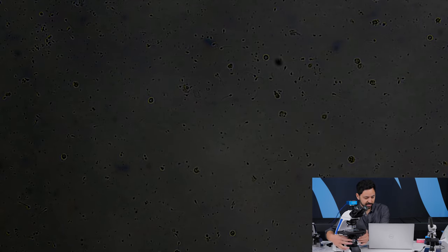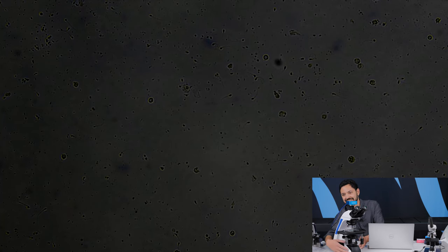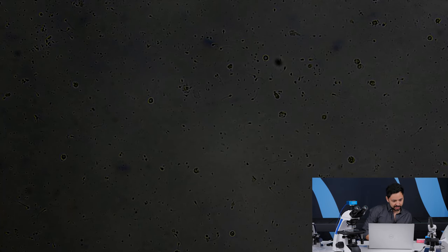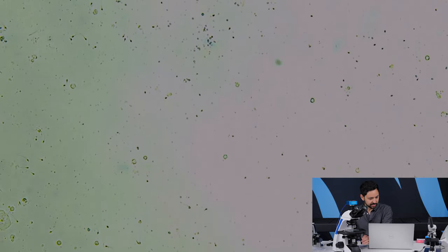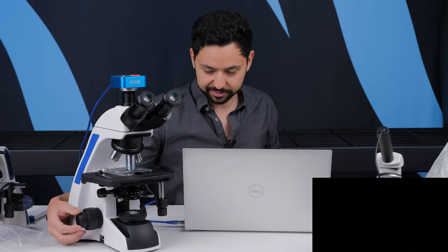Okay, so now we're up here. And again, we do have the condenser iris all the way shut. Now we can start seeing some sperm. I think the brightness is also all the way up already. Trying to, like, feel for everything here. Okay, yeah, that's all the way up. Need to increase the exposure time. Now a higher magnification. Okay, now we're seeing some sperm moving around. So you can tell it's a little bit less magnified than it was before because this camera doesn't add the same magnification levels that the other one does. Let's see if I can get this guy in the center so we can go up to the next highest magnification. This is a 40 times objective now with the camera, which adds maybe, like, another 10 times magnification, something like that. So let's be really diligent about opening up this. And now I can refocus on the sample. And there they are.